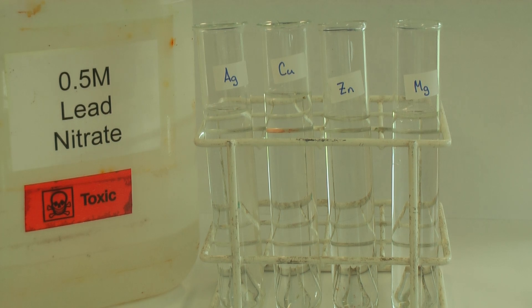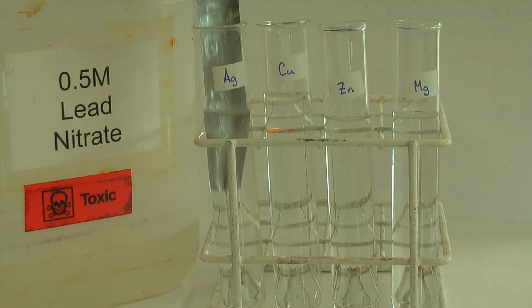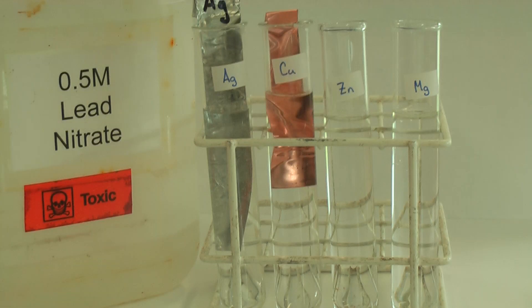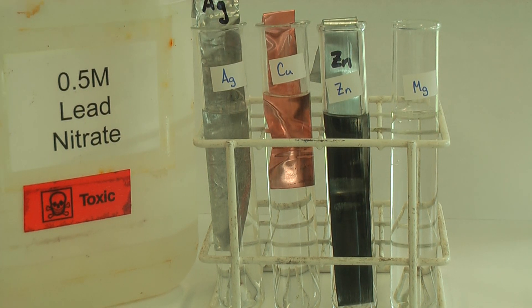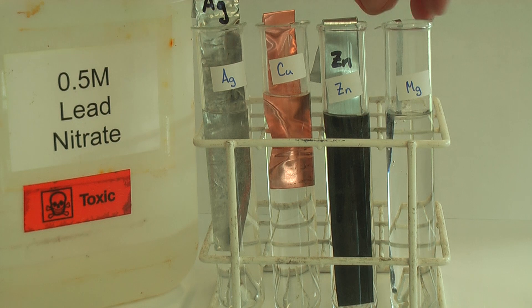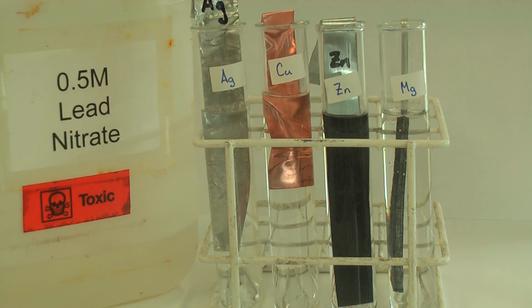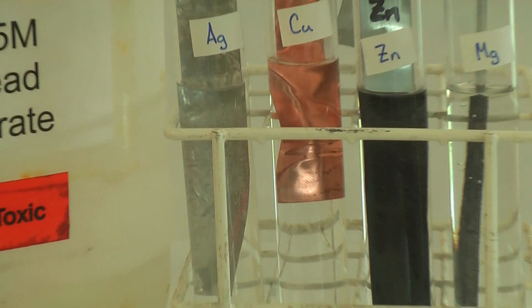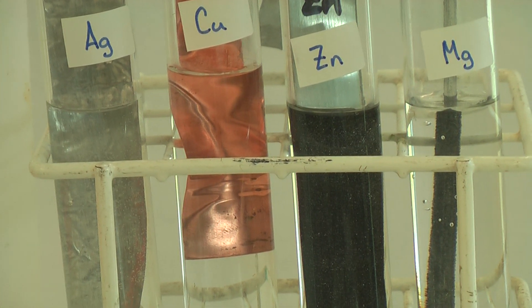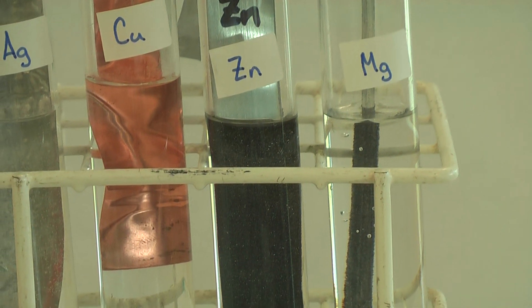I've got four test tubes all filled with lead nitrate. I'm going to put different metals into the solution — I've got some silver, some copper, some zinc, and some magnesium. Let me zoom in: the silver has not really done much, the copper has not really done much, but as soon as I put the zinc in it turned black, and the magnesium has also turned black.